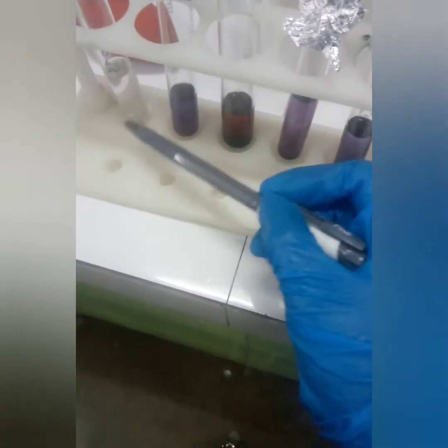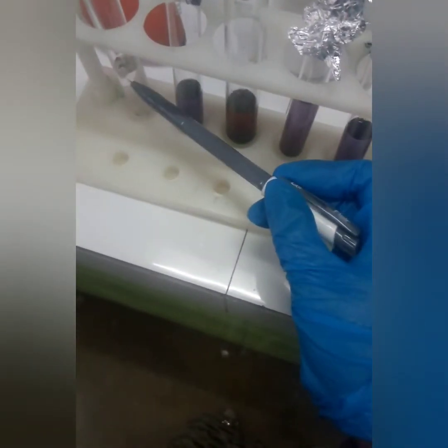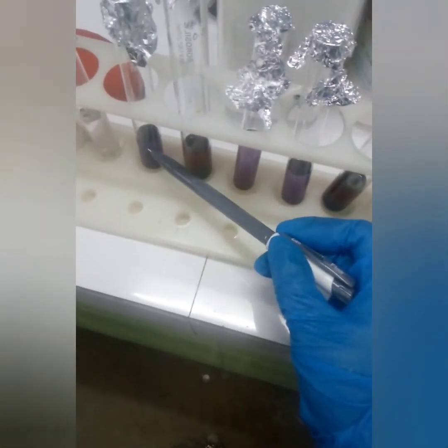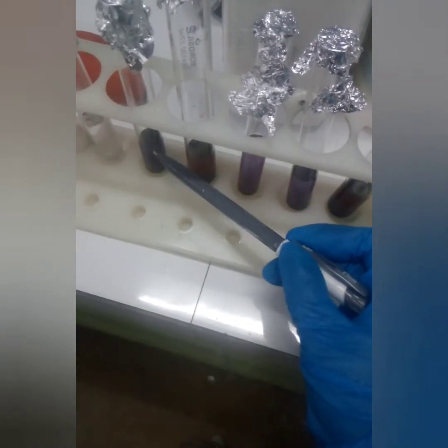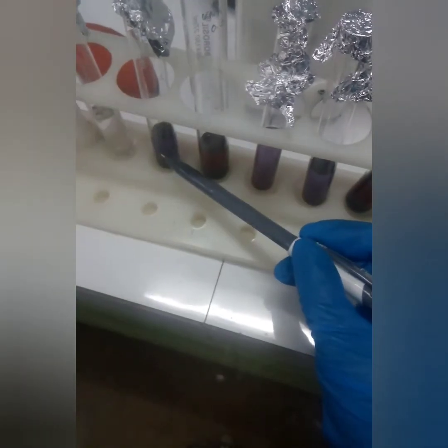Since this is a blank, there is no standard amino acid here, I will just add 4 ml water. Then in the first test tube, there is 0.2 ml amino acid, so I will add 3.8 ml water to make the final volume 4.